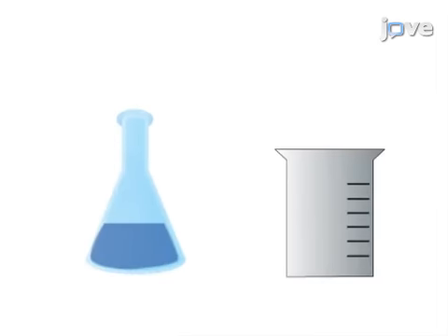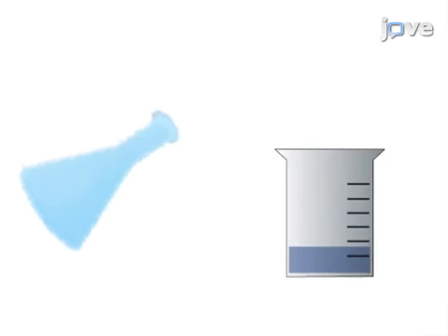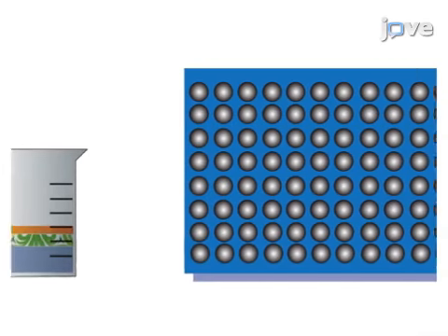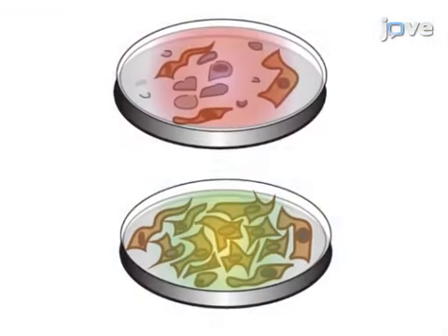Next, concentrated cell culture media is diluted with either untreated production bleed water or cupric oxide nanoparticle treated production bleed water, in addition to standard cell culture supplements to prepare the test media. Untreated production bleed water media and cupric oxide nanoparticle treated production bleed water media is then applied to human kidney and liver cells in culture, and the viability is measured over 7 days.